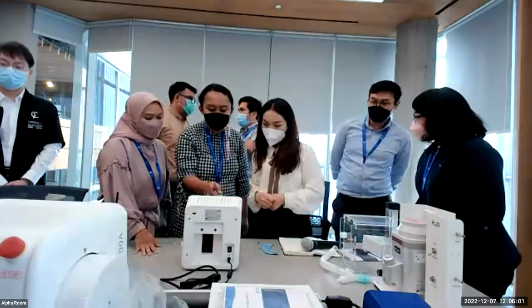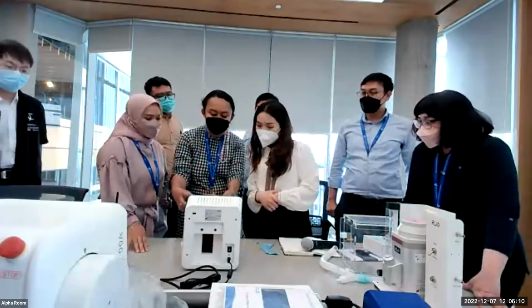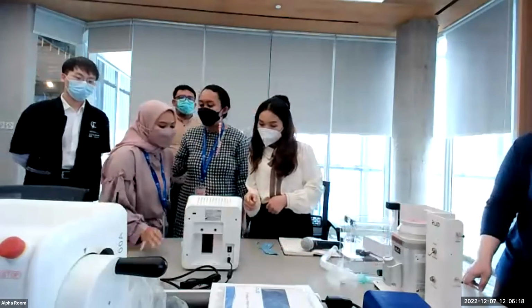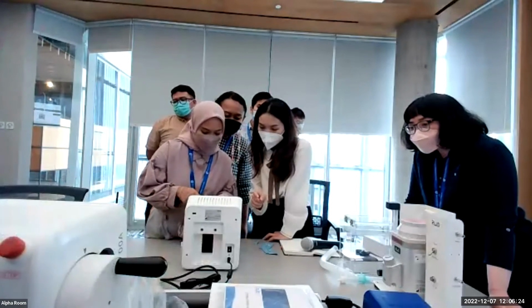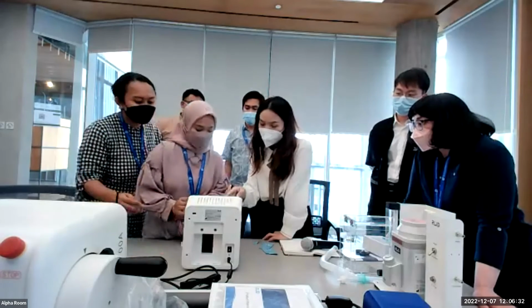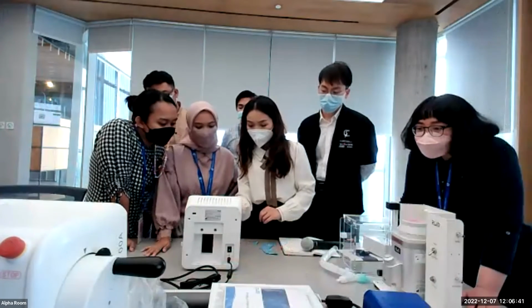Can I back this one? This is console. If we use microscope, we usually move with hand, right? In this one we move with what? So what should we use if we want to move the image? Yeah, you can use the finger, pinch like this. Or you can like this.